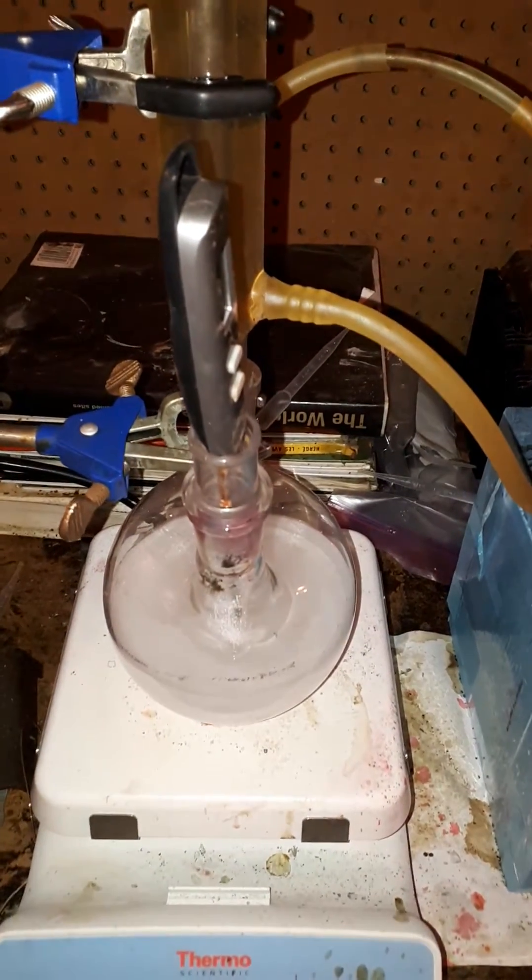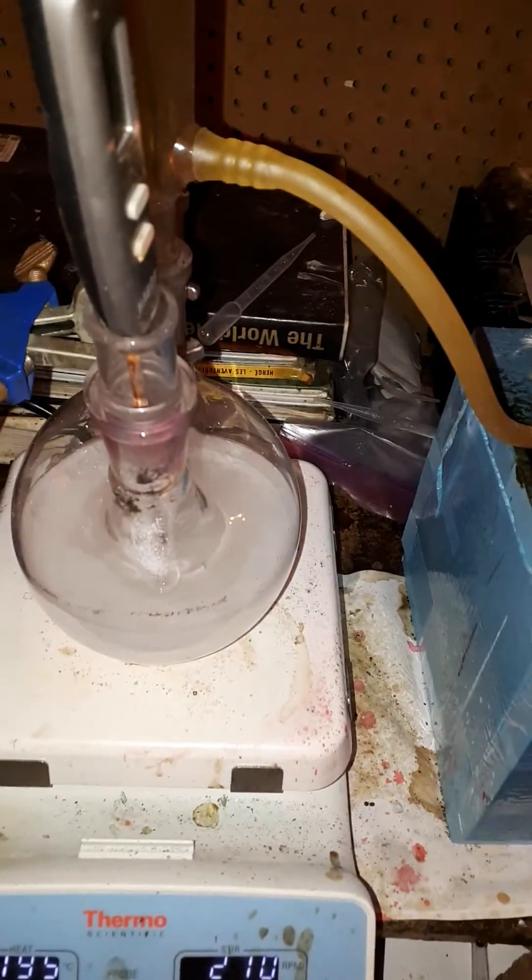It's about 11.4 grams of antimony oxide, measuring at 95 degrees Celsius. It's a water solution.